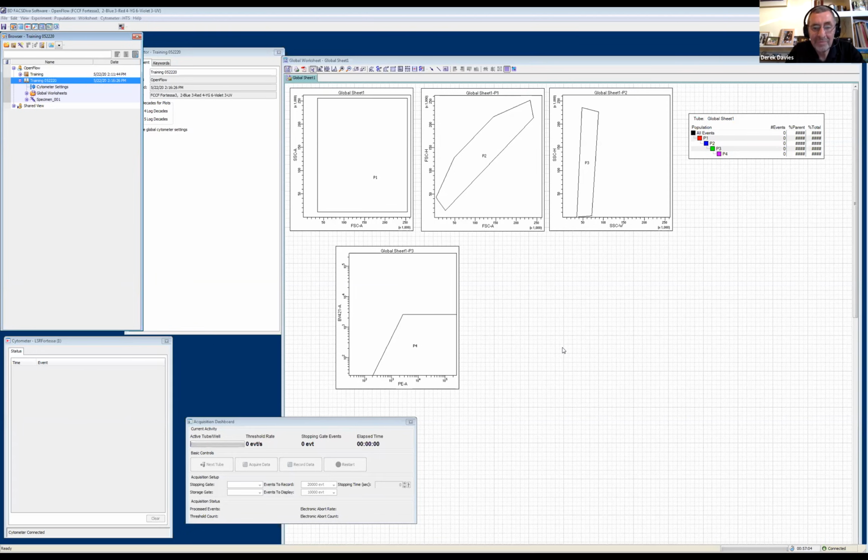Yeah, and somebody's actually giving here a very good suggestion that we may want to mention that there is an automated way of batch exporting PDFs and stats. You know, this would take a little while here now to show, but it is true. It is there, and we can do it.